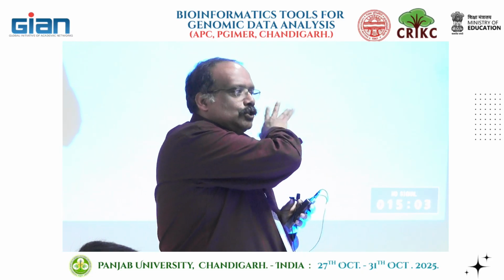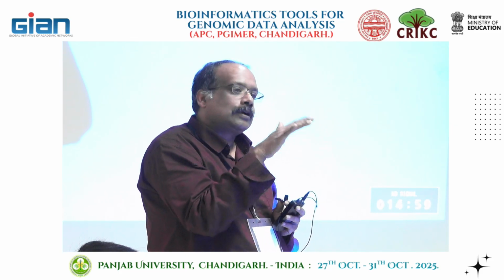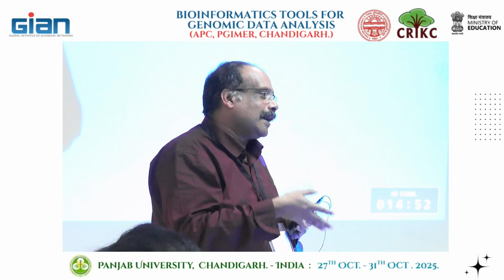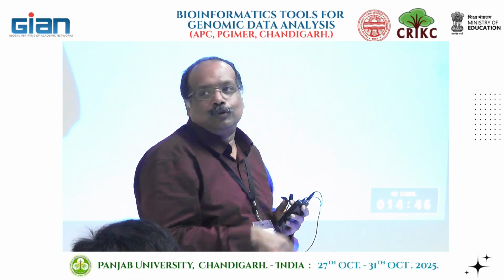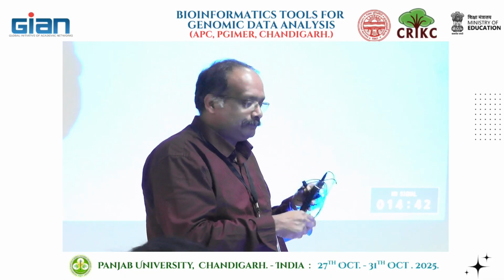Up to this portion, like alignment and all this, before count data, this is something you need to do for everything, irrespective of whatever technique you are doing. You do FastQC, you do the alignment, you do the trimming. All these things are done for everything. Even if it is epigenetics, or variant analysis, anything, you have to do that.